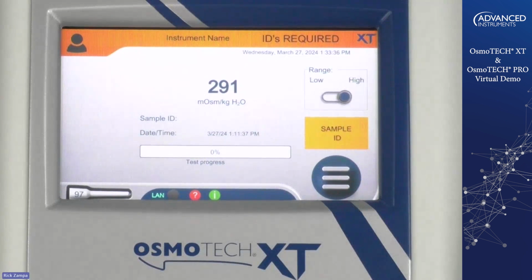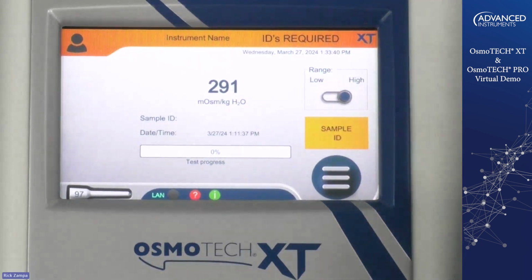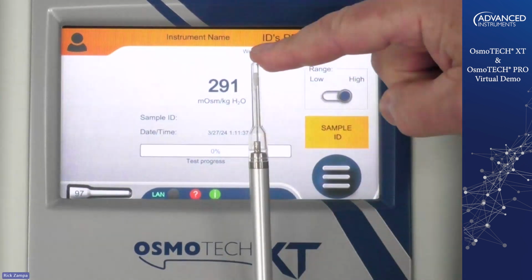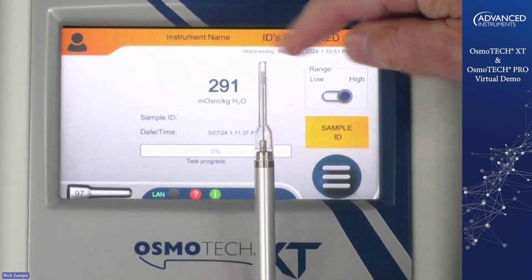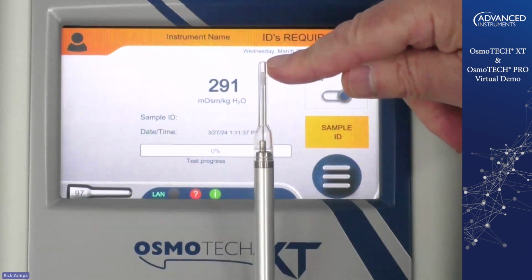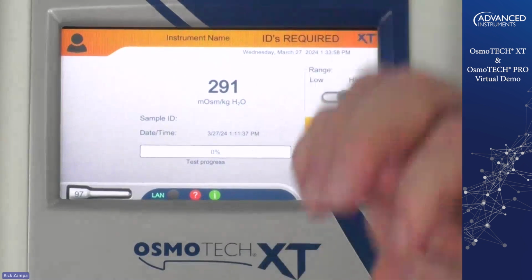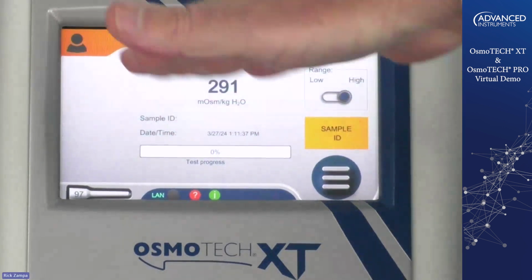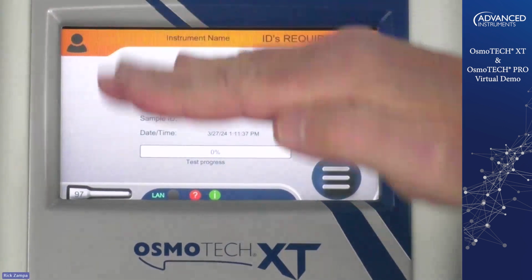If you wick sample out of the tip, so if I were to put a tip on here, there's a good image of this in the user guide, you want the sample to be right flat at the top of the tip. A little bit can be concave, but it shouldn't be depressed below.